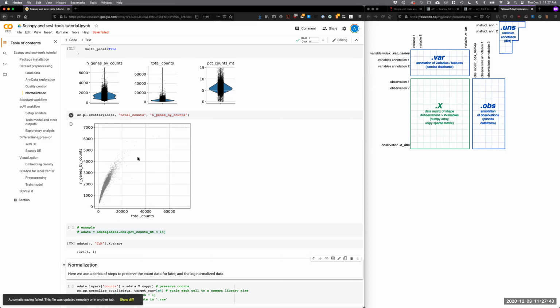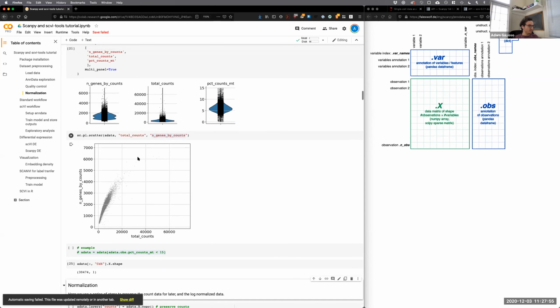It's typically the case that technical artifacts, you'll find that they cluster together later on. And then you might want to remove that later. But for example, you might not want to filter things on the low end because that just might correspond to some cell type. Oh, I see. Okay. It's hard to know a priori what's technical and what's not. So would you say it's better in general to filter out really high UMI counts versus something with really low counts?